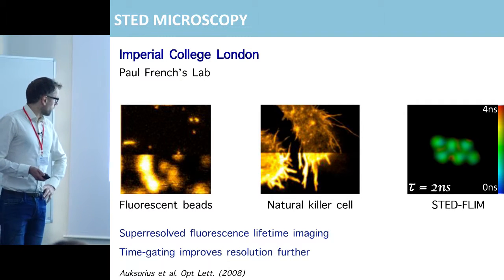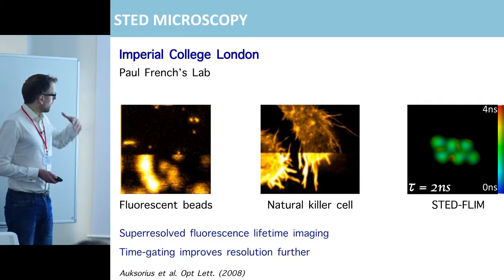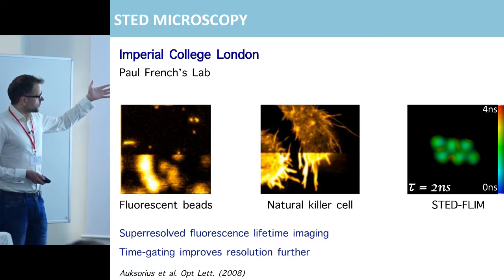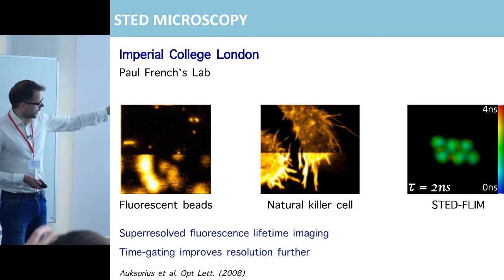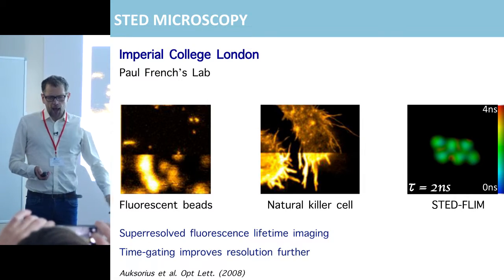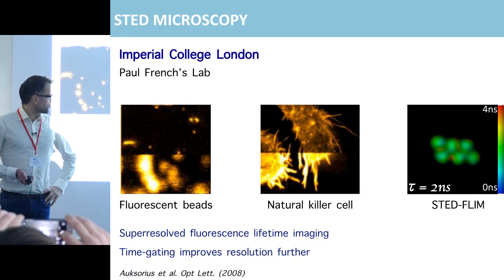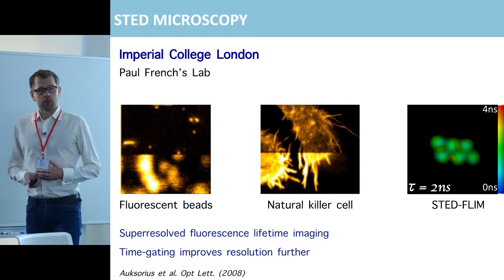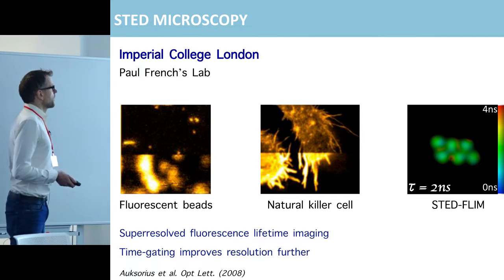So this is on fluorescent beads. It also works well on cells. You can see a STED beam being switched on. So instead of confocal microscope image, you get STED image. Our main achievement there was fluorescence lifetime imaging, recorded with sub-diffraction resolution.